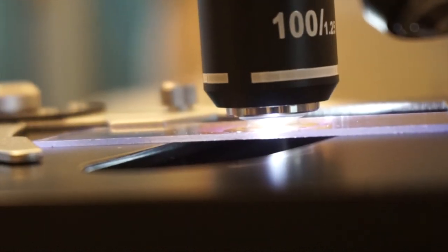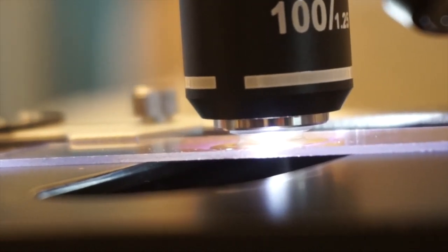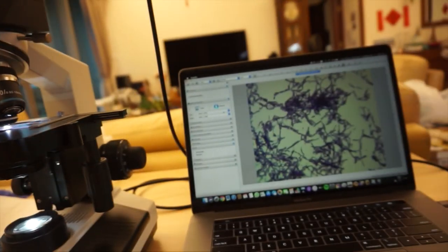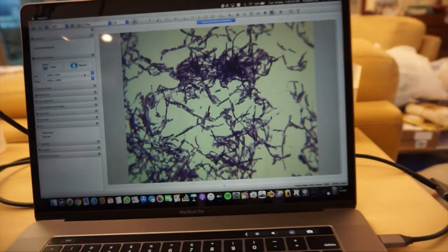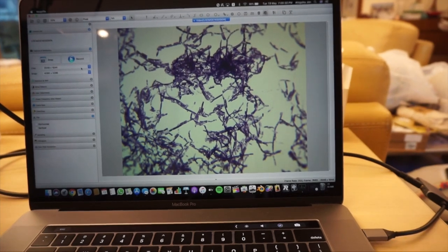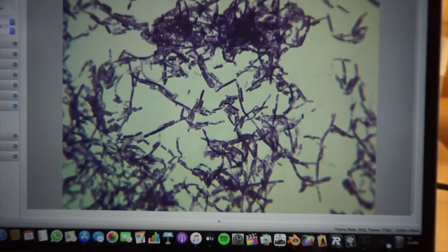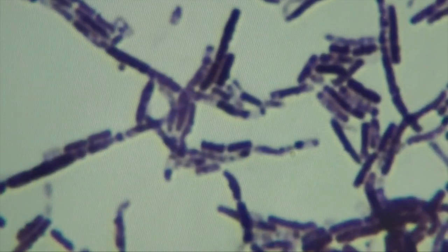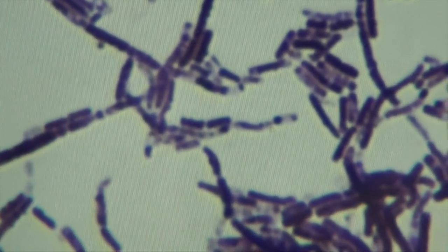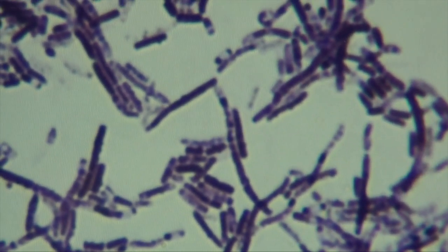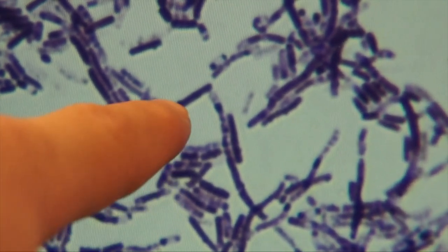So here, what do we see? This is a type of bacteria. As you can see, this is Gram-positive. It's violet, stained by the crystal violet. So here you can see the individual bacteria.